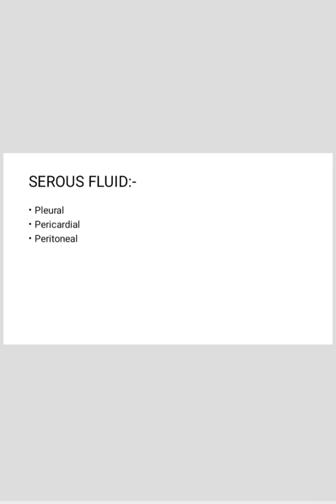In today's class, we are going to discuss serous fluids, their collection and preservation. So, what are serous fluids? Serous fluids are those fluids which are present in the cavity in between the serous membranes, and these fluids include pleural fluid, pericardial fluid, and peritoneal fluid.